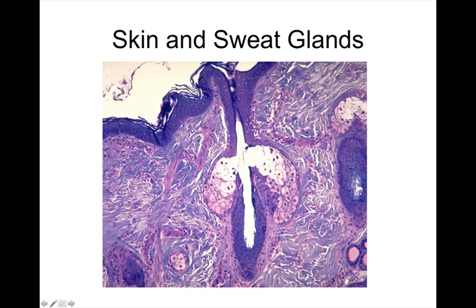Most of the glands you're just seeing are sebaceous glands, and sebaceous glands almost look like stratified squamous tissue again. Yeah, it's got that kind of scale-like look. They're flat. But in real life they're probably more spherical. They're probably more like the adipose tissue soap bubble than like the cookie sheet kind of thing. But down here in particular, you can see that there are little cuboidal cells surrounding a lumen. That's pretty clearly some kind of eccrine sweat gland. This I could be convinced is one as well, but it's just a kind of funny cut.